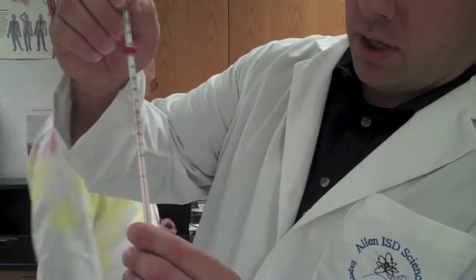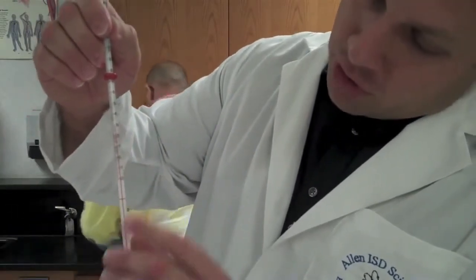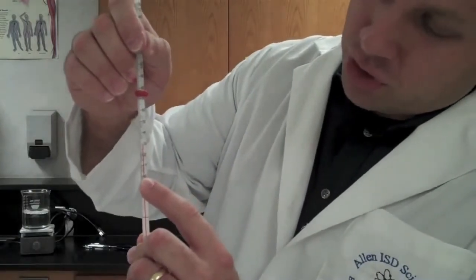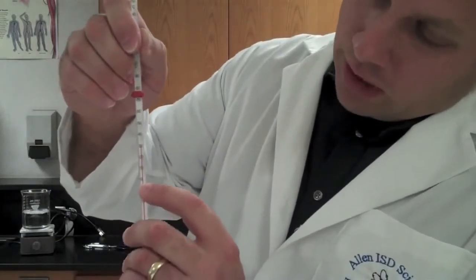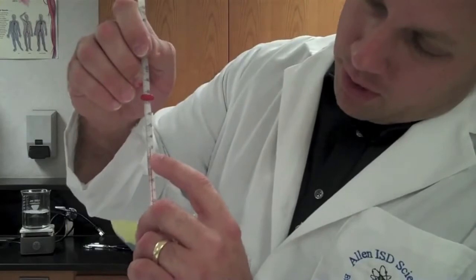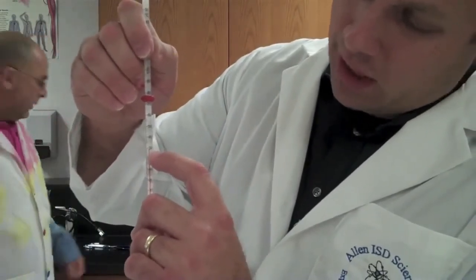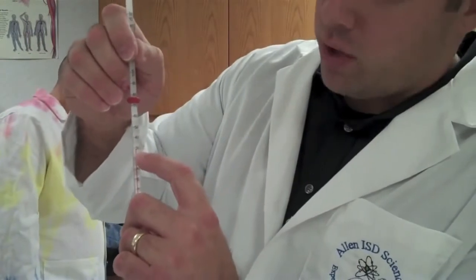We're going to move to the next one. Let's show this real quick. I'm going to do a close-up view here so you guys can see. You can see the thermometer. But you can see here in the thermometer, here is zero. That would be freezing on the Celsius temperature scale. And you see the little red line that moves up. And you simply match the lines that are printed on the thermometer with the red line to get an accurate reading.